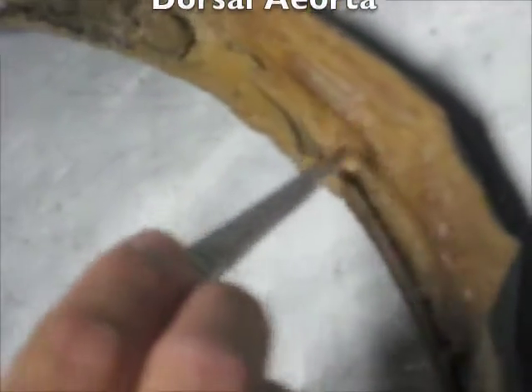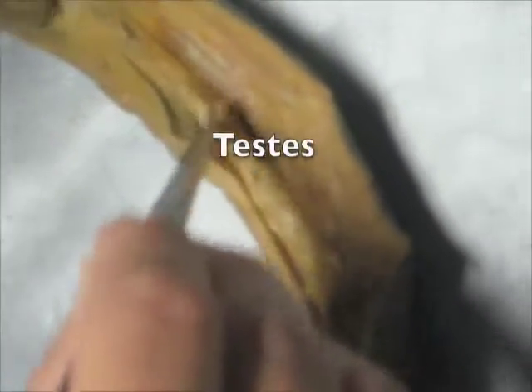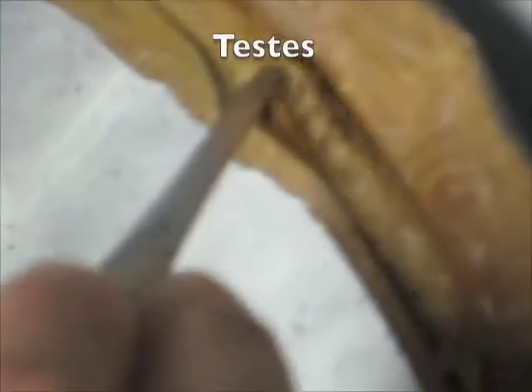And then when we come down into the abdominal cavity, this one is a male because we're looking at testes. The structure that I'm holding right here is the testes. What do ovaries look like? Usually whenever you find the ovaries, they're so impacted with eggs that you cannot miss them.